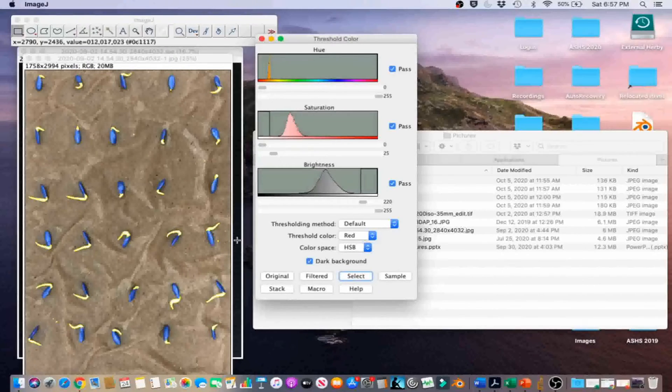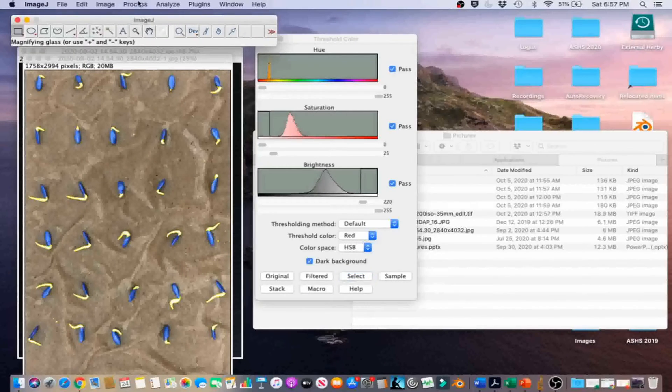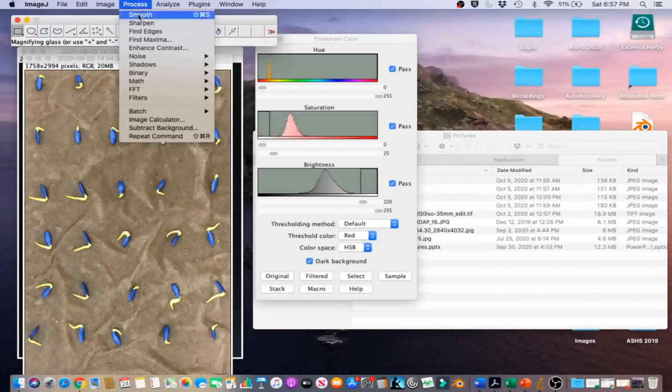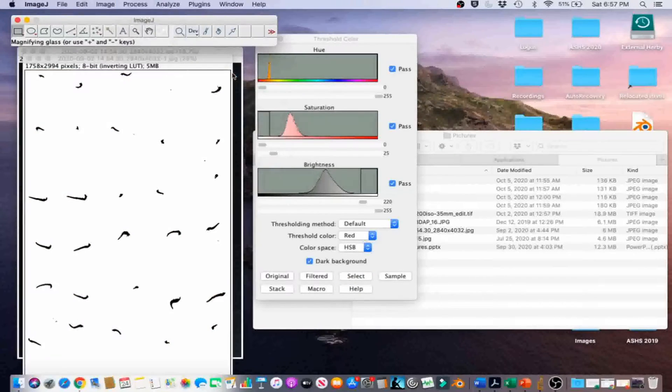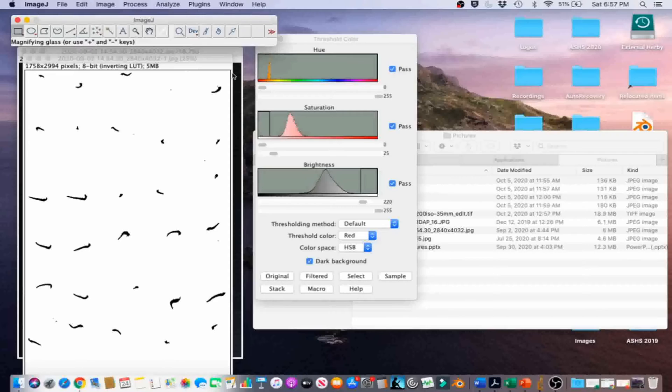Go to Process, Binary, Make Binary to convert the color image to a binary image.